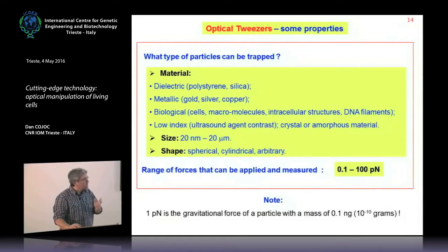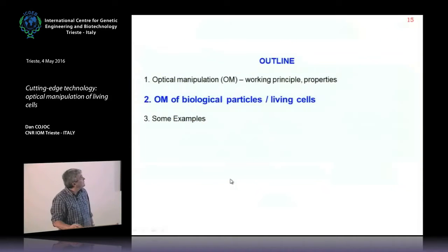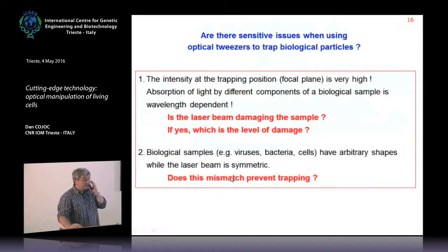So we can also play with mechanics to mimic the behavior of the cells. Some examples: biological sample trapping.